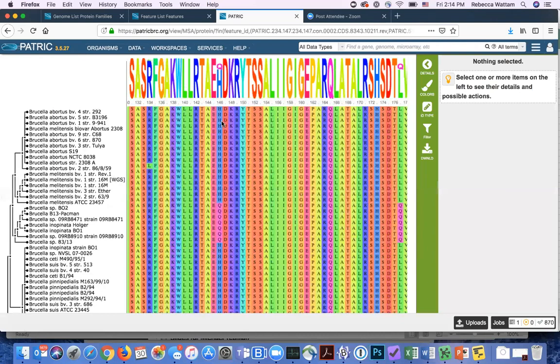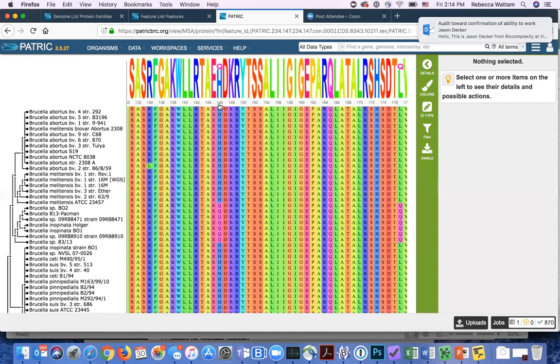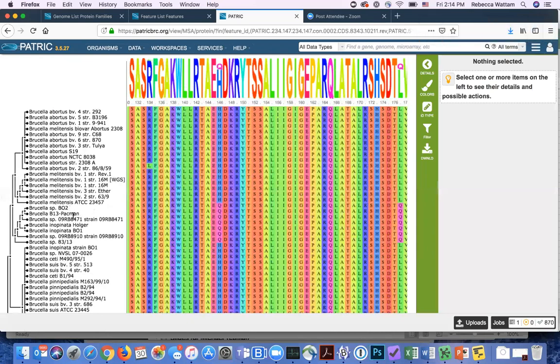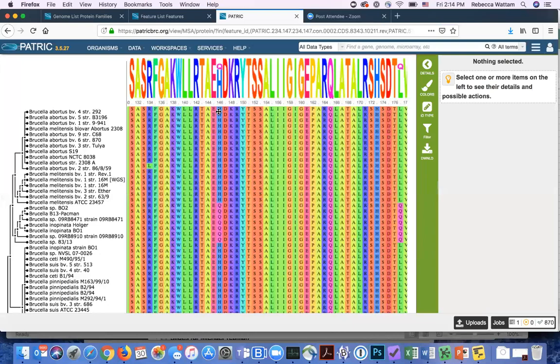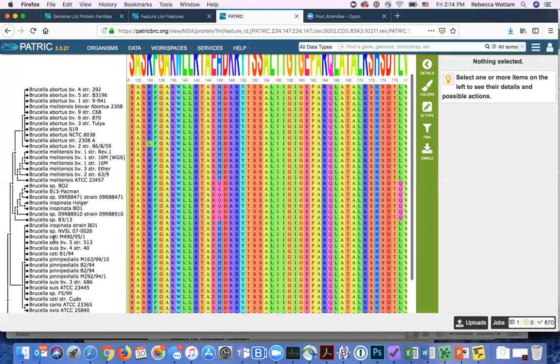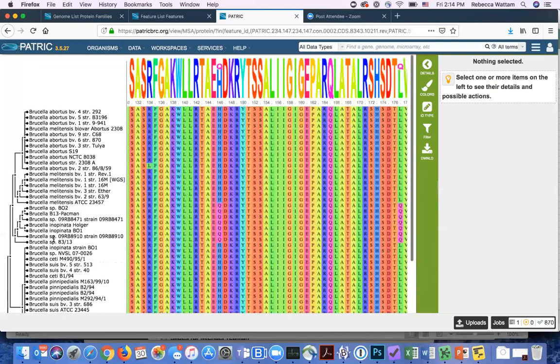For example, in this column, you see the amino acid is either H or Q and you can look down and see that this particular group, which are these genomes that are the ancestral Brucella, all had this amino acid and it looks like the more recent Brucella have substituted an H for that. And so it's that simple.